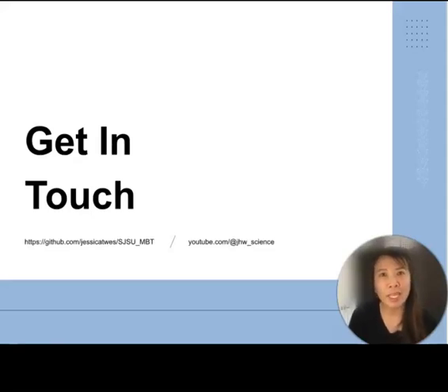And the reason why I say that is with option 2, when you're using the SRA Toolkit, it requires you to download the application and get it set up on your computer. That can bring with it some headaches that I will go over next time on how to go about overcoming some of the challenges that you may have trying to set up the SRA Toolkit.